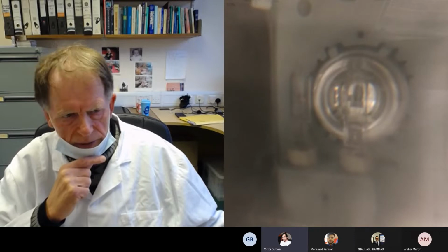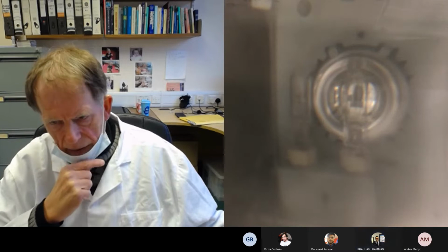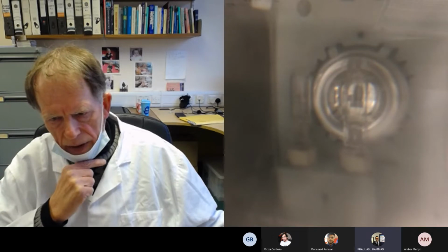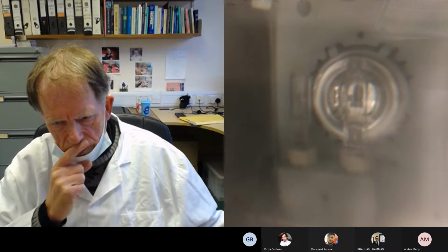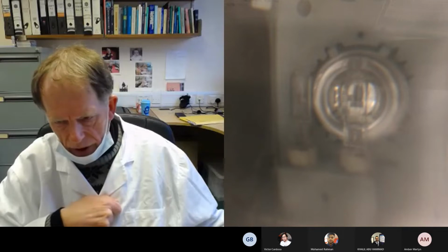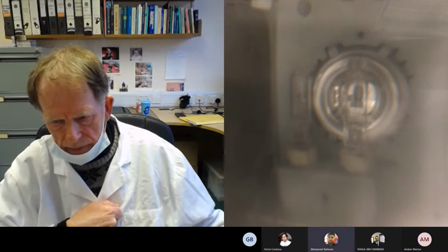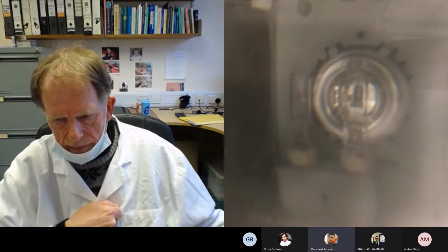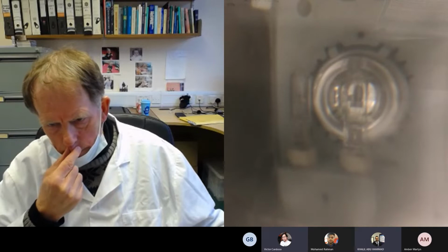Does everybody else agree? Khalil? I have got 0.889. No, that can't be right. What I'm asking for now is the mean absorbance value. You've got three values, 0.603, 0.604, and 0.597. We want to know the mean of those three values. 0.601. Yep.